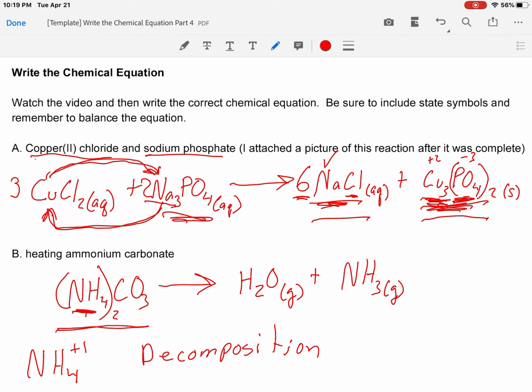The second way is that ammonia is a base. And when I tested with some litmus paper, it indeed turned the red litmus paper blue. And when you test with litmus paper, litmus is a simple acid-base indicator, and B is for blue and B is for base. So that red litmus paper turned blue, or blue litmus paper will stay blue. That indicates a base. Okay, and then the third thing I tested for, I took a wood splint and kind of stuck it down the mouth of the test tube.